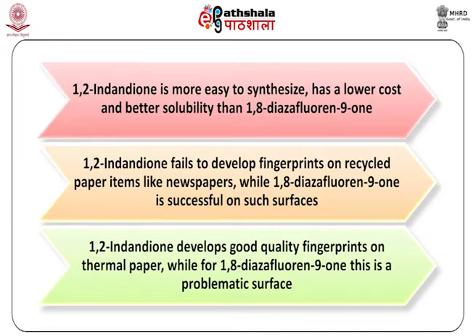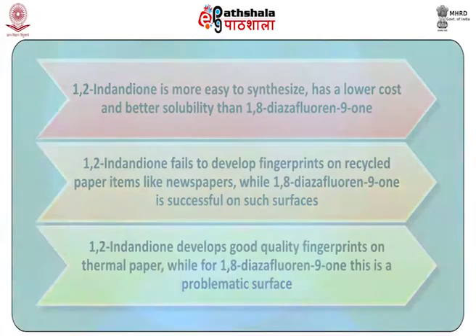1,2-indandione fails to develop fingerprints on recycled paper items like newspaper, while 1,8-diazafluorene-9-one is successful on such surfaces. 1,2-indandione develops good quality fingerprints on thermal paper, while for 1,8-diazafluorene-9-one this is a problematic surface.